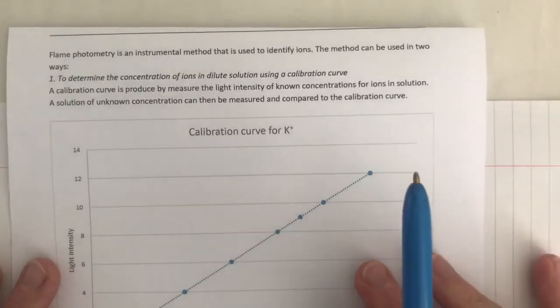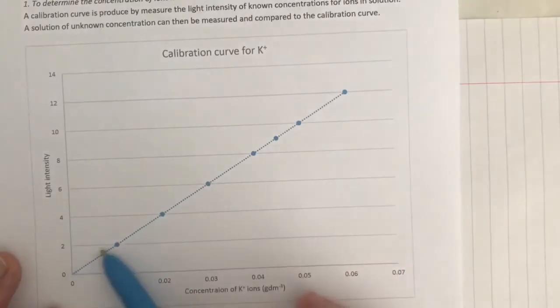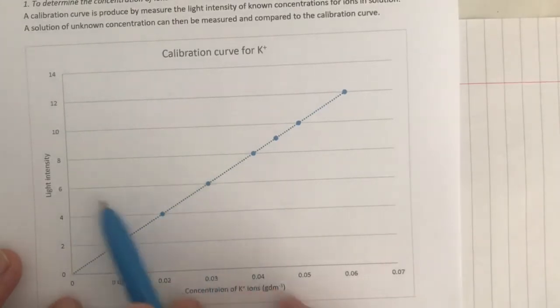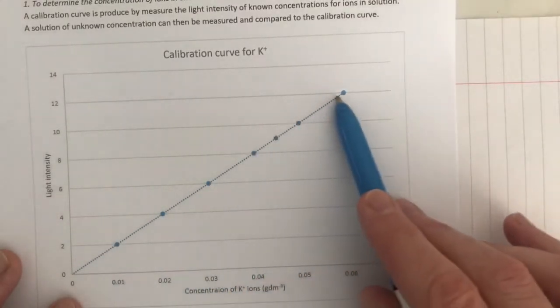To do this, all we have to do is get our sample of the ions in solution, and it has to have varying degrees of concentration. You see here the concentration is increasing, but these are known concentrations. We know how much of the ion is present in each solution. You would run this through the flame photometer, and it would give you a level of light intensity for each of the concentrations. And from that, you would draw your calibration curve.